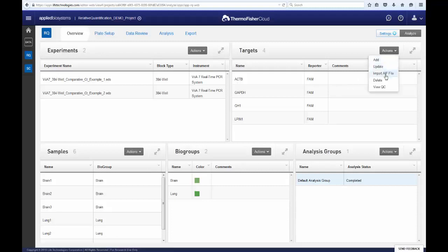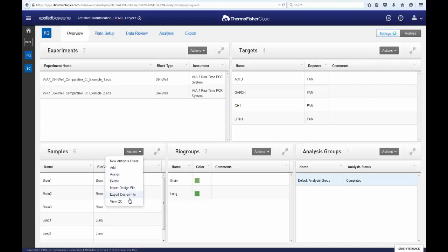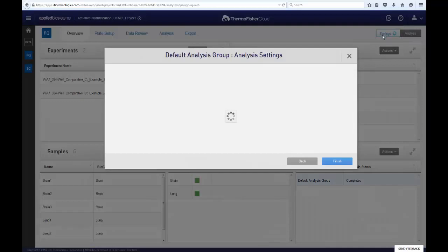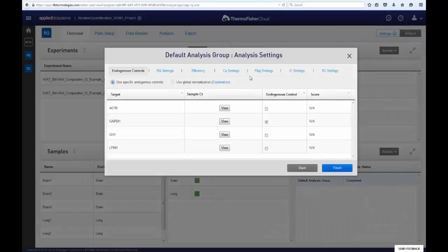You can make modifications by using the respective action menus for each of the categories. Before proceeding in the app, be sure to set your endogenous control or use global normalization.